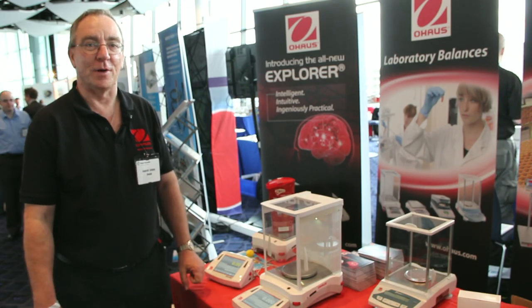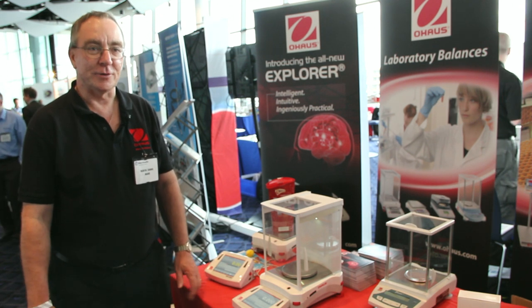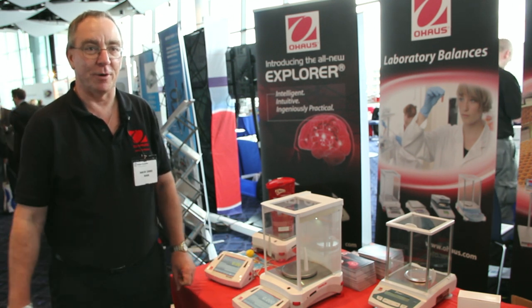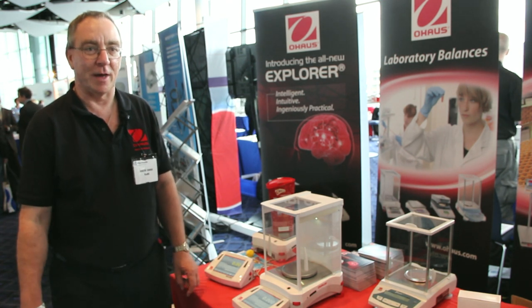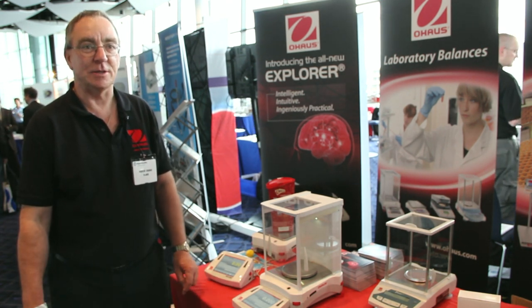Good afternoon. Marcin Corse from Ohaus, introducing the new Ohaus Explorer range of balances, introduced to the market in about June of last year as our top-end range of balances.